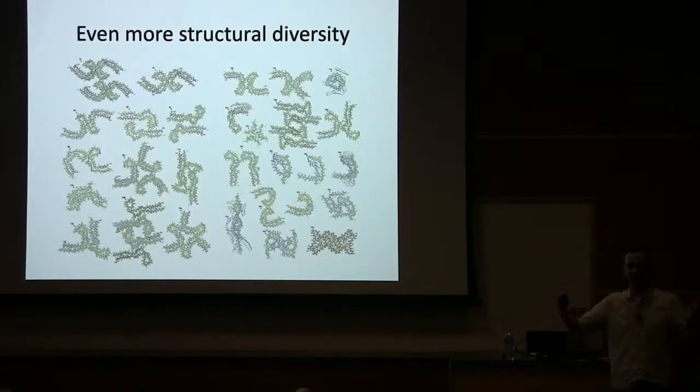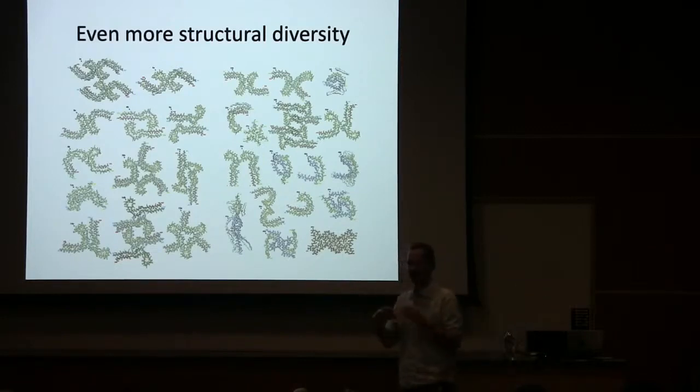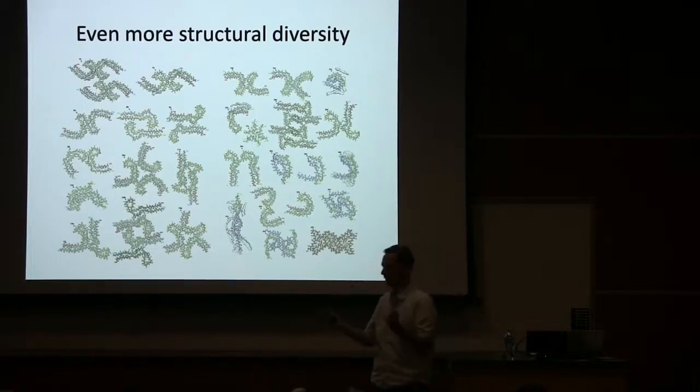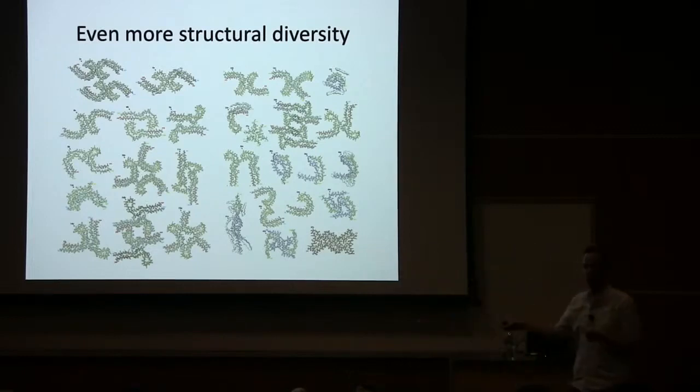Now, in doing all this, Sofia managed to solve 76 different structures in the span of 1 year, and these are some of the structures that are all different from any of the disease-related structures we had observed before. So this is all tau, all assembled in vitro, different constructs, different pHs and salts, etc., just to bring home to you the observation that proteins have evolved with their amino acid sequence to adopt one fold, or perhaps no fold, with intrinsically disordered proteins like tau. But the same is not true for amyloids. There is not, this is the amyloid structure of this protein, I think is the wrong way of thinking about it, because the same protein can adopt many, many different conformations.